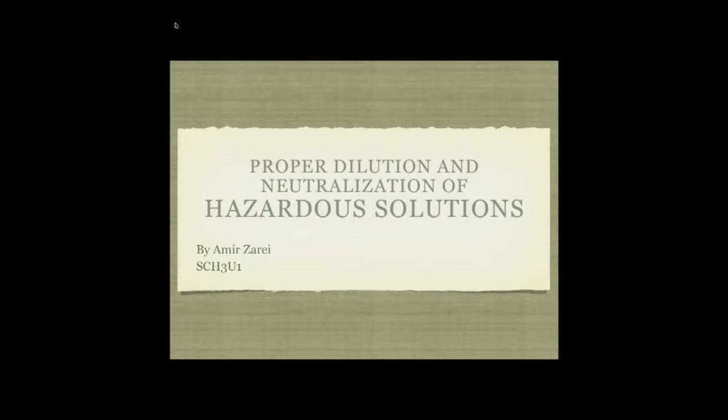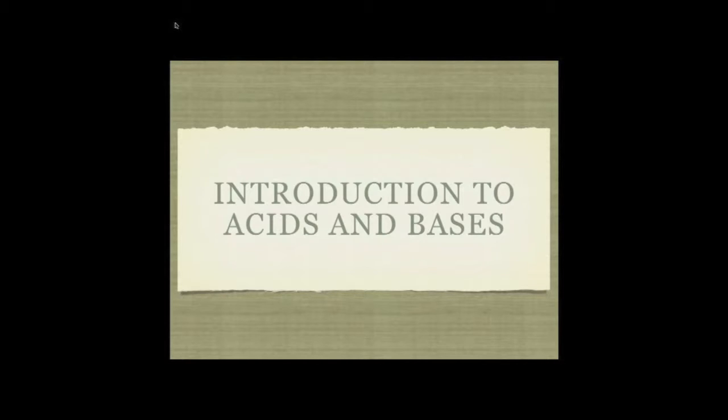Hello class, my name is Amir Zareh, and I will be talking to you about the proper dilution and neutralization of hazardous solutions. To fully acquaint ourselves with this subject, we must first understand what acids and bases are.